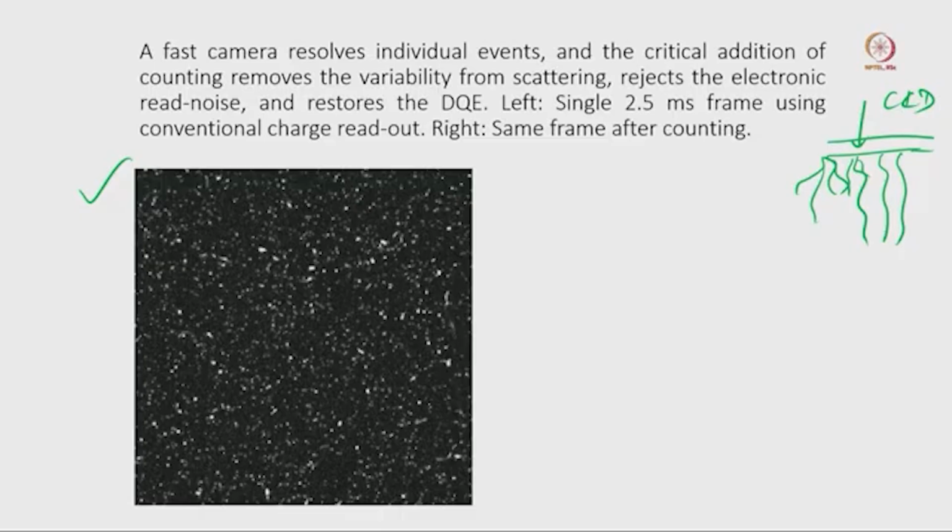In the CCD camera you can see some of these spots are very bright, and some are very light. If we look closely, the contrast of some spots is very low, but the contrast of others is very big, and the spot size is also very different. When the electrons travel in different directions like that and hit, they generate more electrons and everything is recorded here. That affects the result, so even for a single electron event, the signal is not uniformly distributed. In some areas the intensity is very strong, and in some areas the distribution is much less.